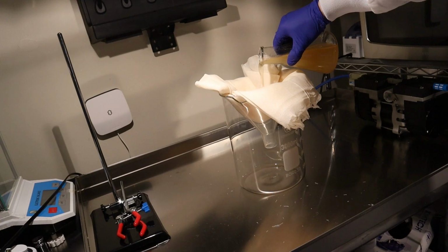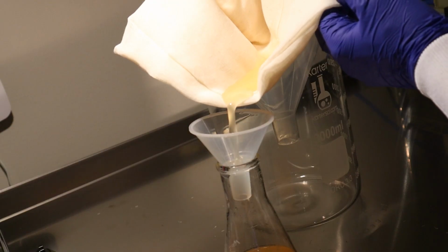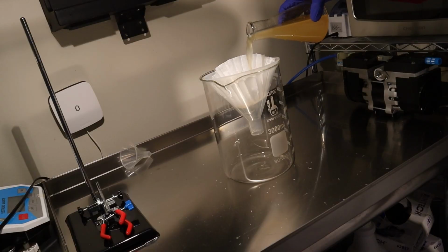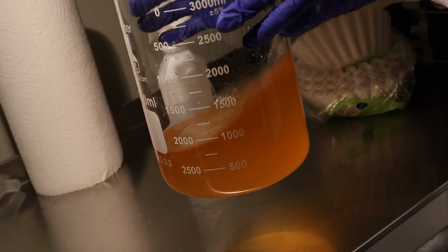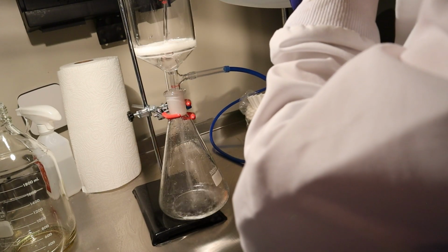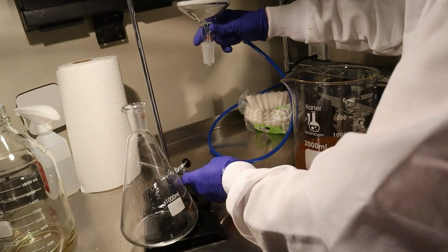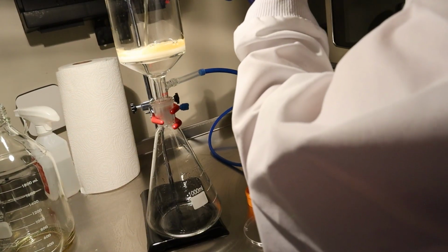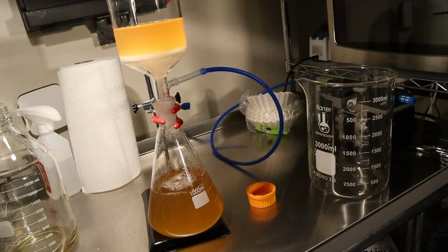After 3 days of incubation, it was time to attempt the extraction again. I began by attempting to filter it through a cheesecloth, which I found to be quite stupid. So I swapped it out for a coffee filter, and deciding that still felt stupid, I set up the vacuum filtration setup with a Buchner funnel and carefully added a filter paper disc and gave it a good seal after pumping some distilled water with it. I then dumped out the water and ran the culture through it. After seeing how fast it was, I wish I never used the coffee filters to begin with.